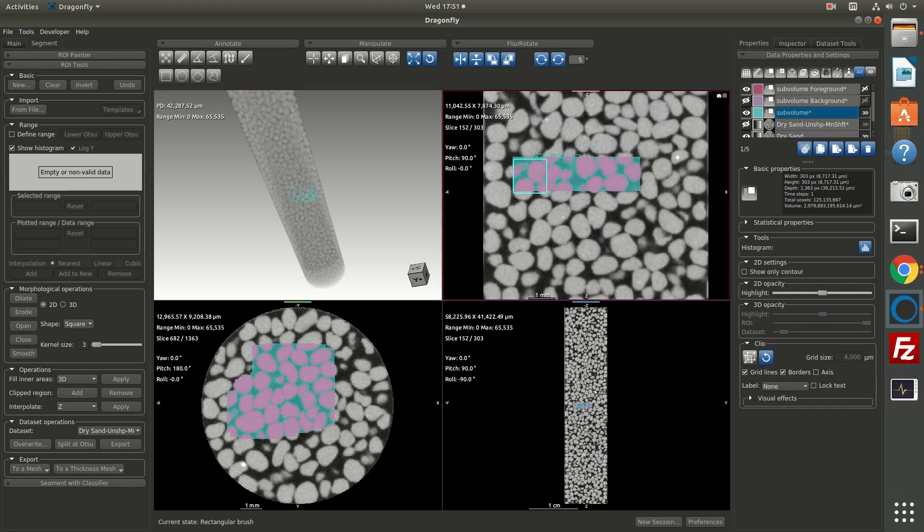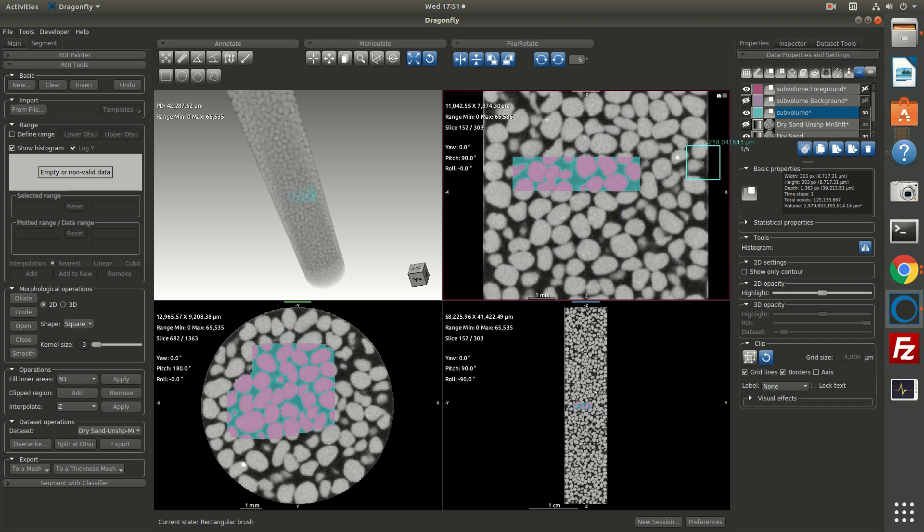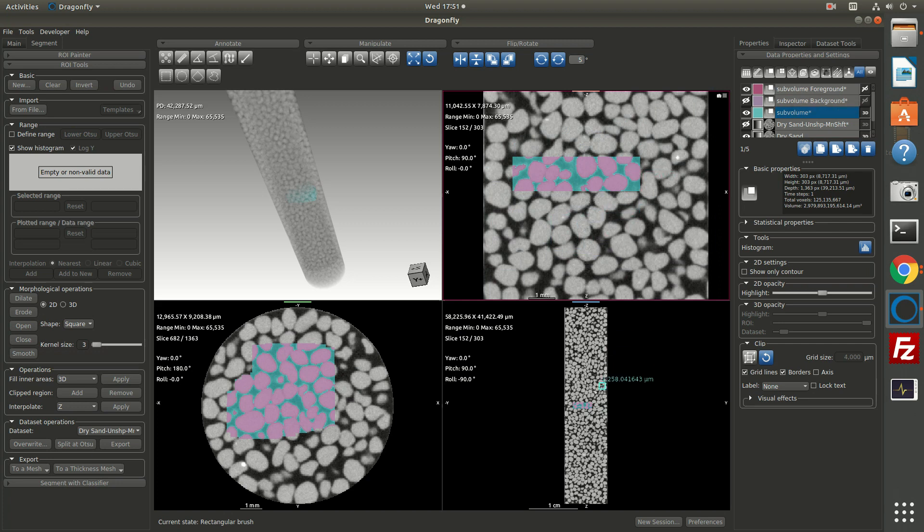Now this was done by manually painting an area with the paintbrush. What we would like to do is have the entire cylinder, except for the edge of the core liner or the edge of the Kapton tube painted. So I'm going to show you how to do that quickly.